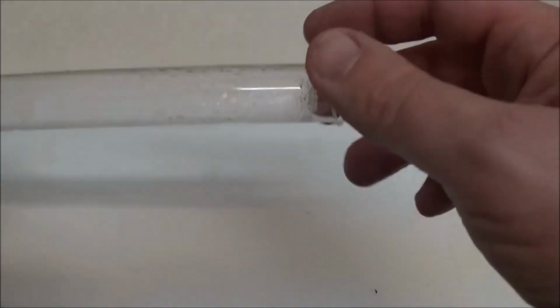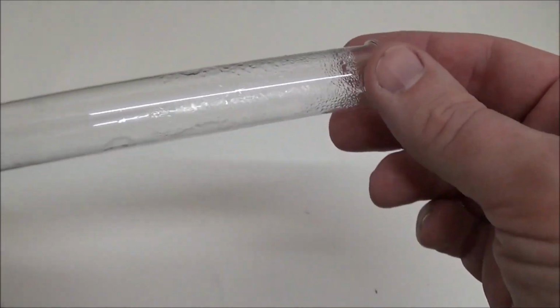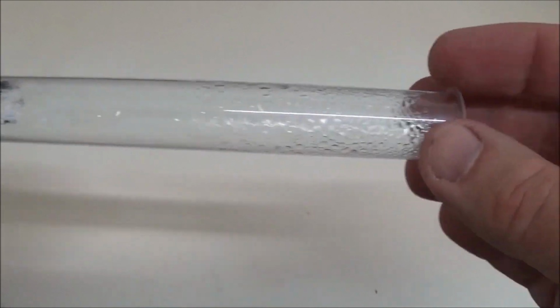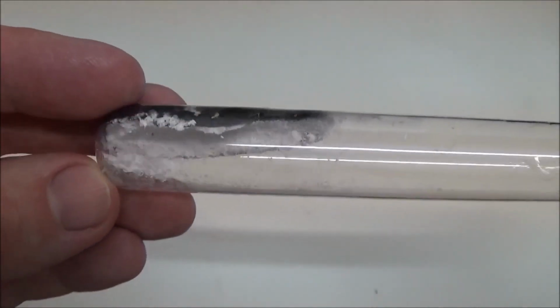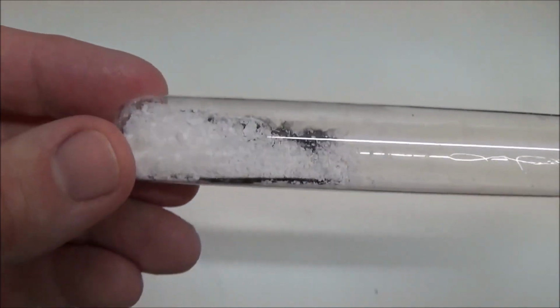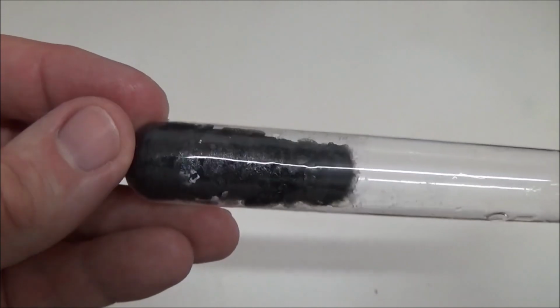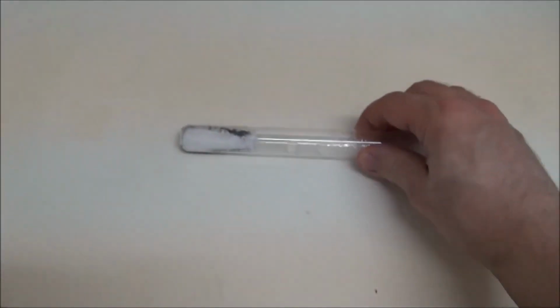After cooling, let's take a look at the pyrolysis residue. Condensed water can be seen in the upper part of the test tube, which has escaped as crystal water. The crystals have lost their luster and have clumped together into an off-white mass. In the lower parts of the test tube, which were directly exposed to the burner flame, carbon residues can also be seen, which often occur in the incomplete pyrolysis of organic substances.